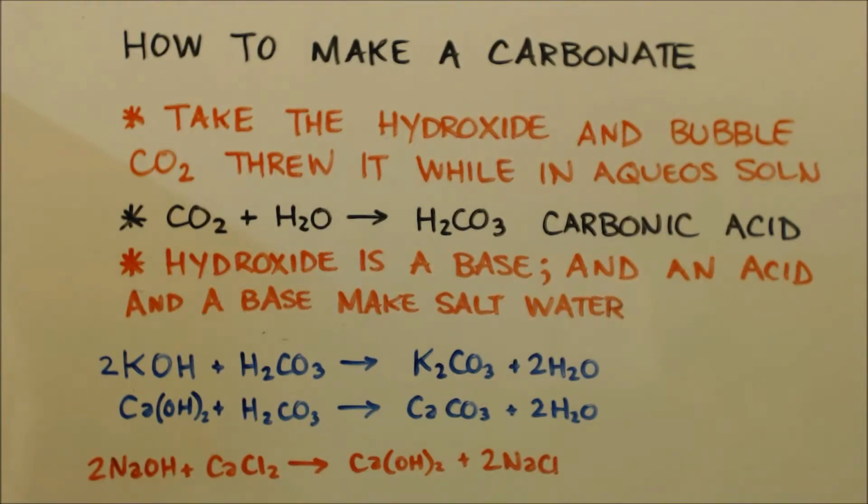Now potassium and sodium hydroxide, they're soluble. All the other hydroxides are either slightly soluble or almost insoluble, if not insoluble. So let's use calcium hydroxide as an example. Okay, so let's go down to the next example with the calcium hydroxide. All hydroxides except for potassium and sodium, I can't buy at the store. You know what I mean? I have to make it.